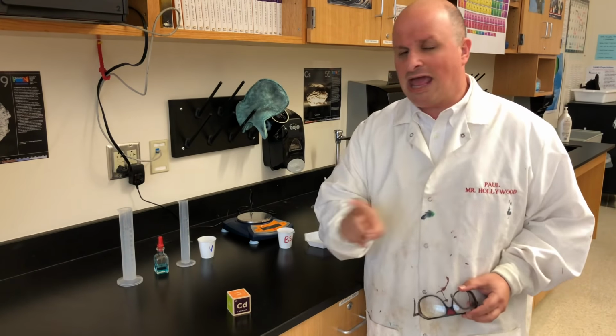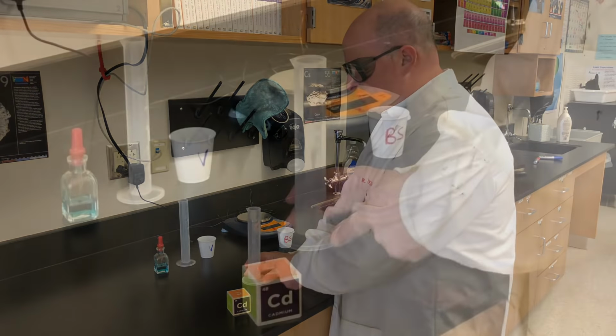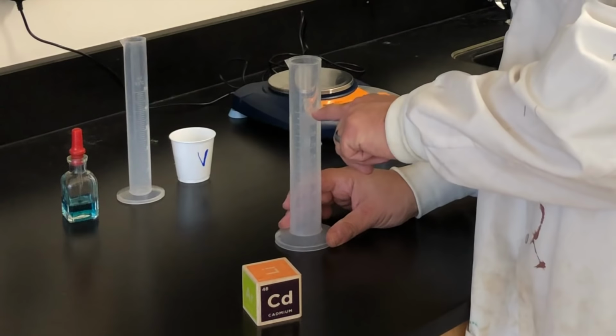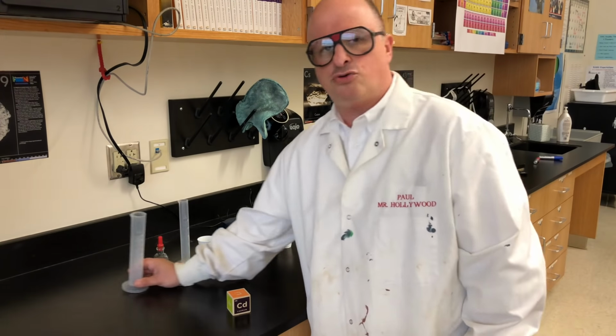You're going to have all the following equipment for your lab, including 2 graduated cylinders, a large one and a small one, a squeeze bottle that has dish soap in it, a container of vinegar, not a lot of vinegar, but just enough for this lab, and a container of baking soda, along with a weigh pan and a scale that you'll have access to. Your job is to mix together just the right amount of baking soda and vinegar and dish soap so that the bubbles in your graduated cylinder will stop exactly at the 100 mark. They won't go any higher or any lower. We want the bubbles to stop right at that 100 mark.